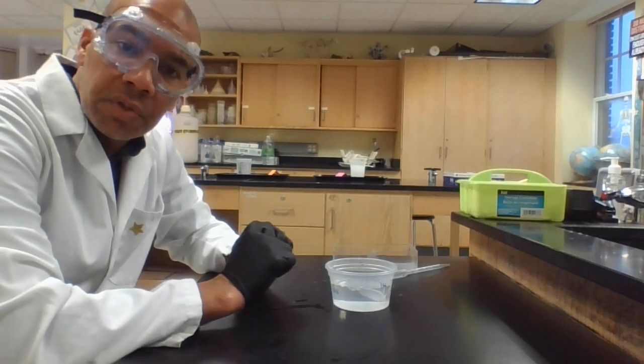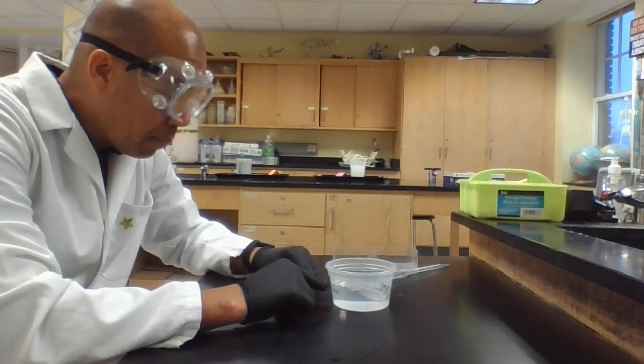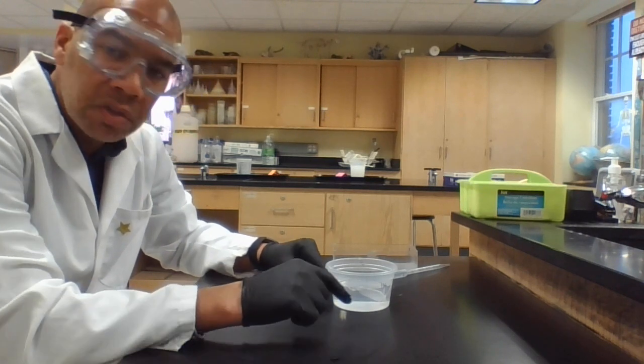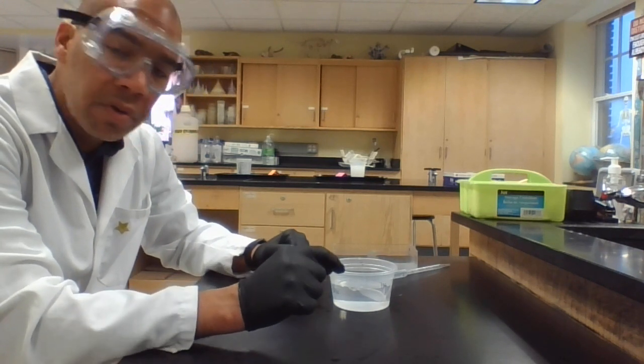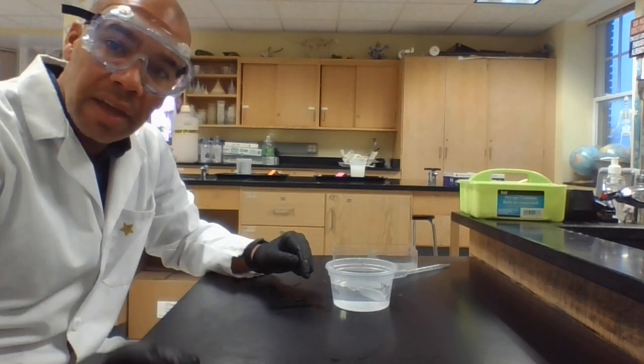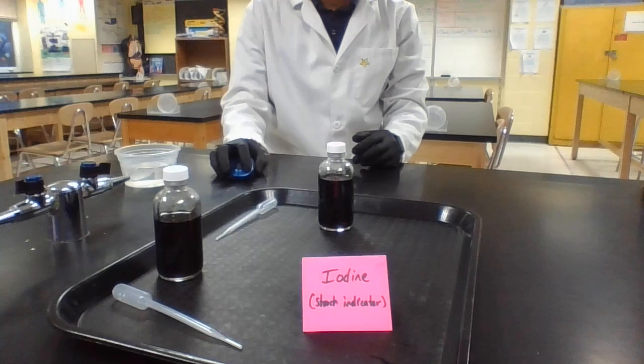So you place it into that cup of water, bowl of water, and I know that there's some initials on here already. You can cross those initials out with permanent marker, and you can put your group's initials, okay? Some way to kind of remember yours. This next step is very important.